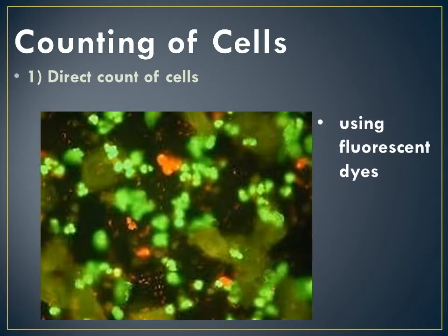Fluorescent dyes are becoming more used in recent years for a variety of procedures, one of which is bacterial counts. These dyes can be employed to stain all species, a particular species of interest in an environmental sample, or even a specific component of cells.